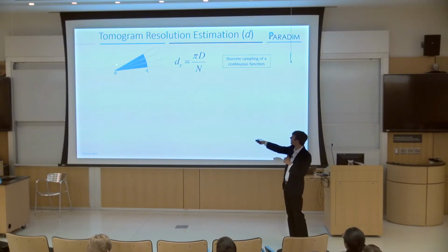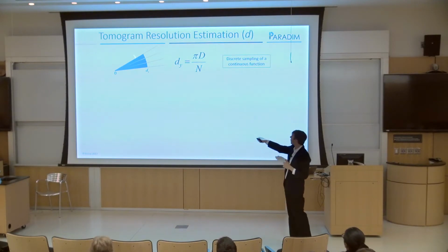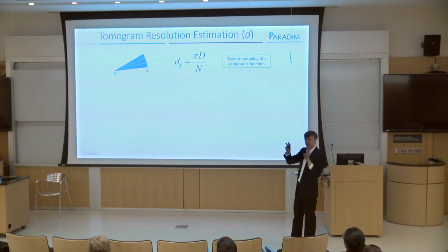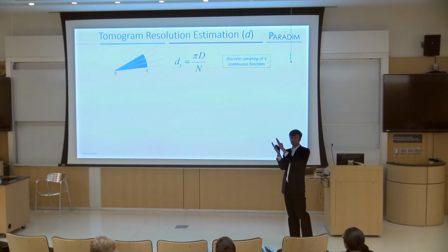You can see we actually oversample here because these 3 projections are very, very close together. But as we get further and further away, those projections know less and less about each other. They're less connected to each other, right? So this overlap is kind of set as the maximum resolution that you can do along that direction, because you've discretized the sampling of this information along that direction, okay? So if you know about the missing wedge, this is kind of the unknown missing wedge, the little mini missing wedge between each projection, okay?